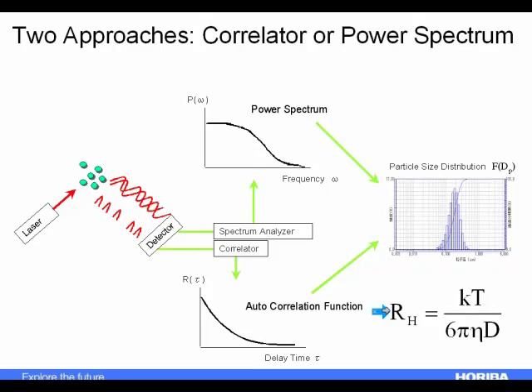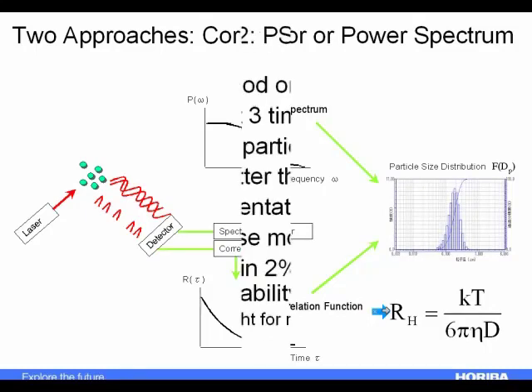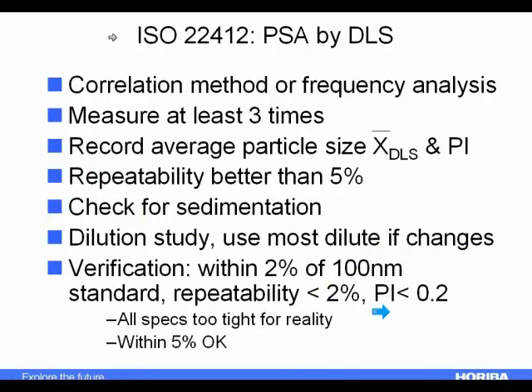And let's talk about now what values from dynamic light scattering might be important for use in setting specifications. Often when I start providing some advice, I try to not only make it advice from yours truly, although he's experienced, perhaps I'm biased or occasionally even wrong. So I'll usually tell you when something is just in my own humble opinion.